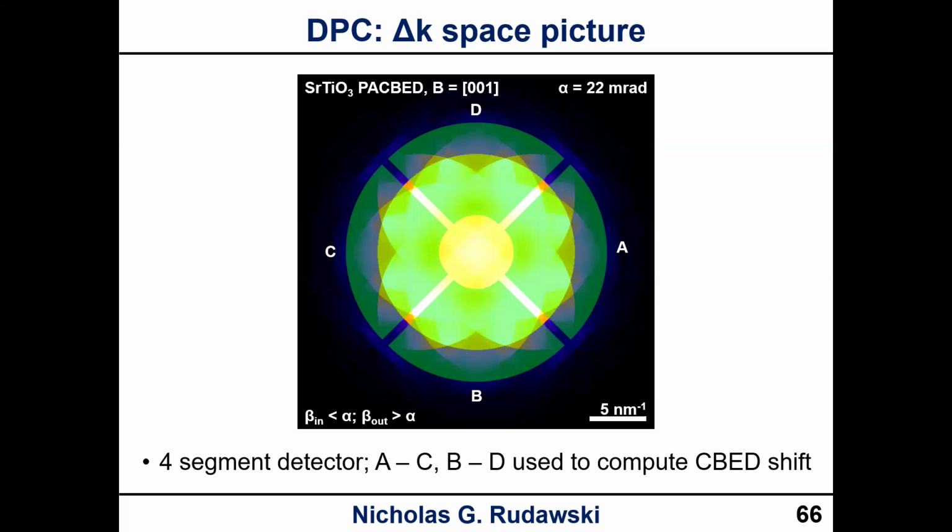I am aided by, on our system, a piezo enhanced stage, which is really nice because that allows really fine positioning along the Z-axis. I think they claim that has picometer sensitivity, but that is great to just bring the sample up and be really precisely focused just with the stage alone, and then we can fine tune the focusing from there with the lens. So the short answer is use the stage for most of the focusing, use the lens for any fine tuning after that.